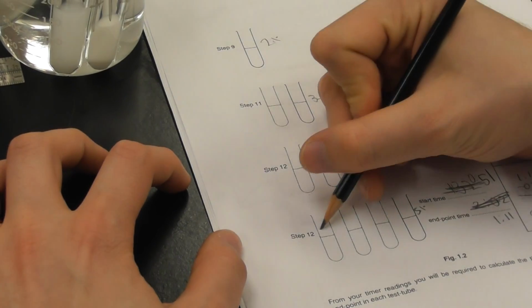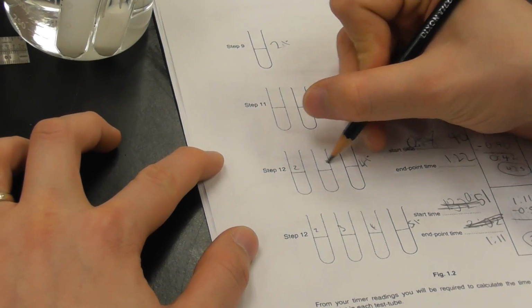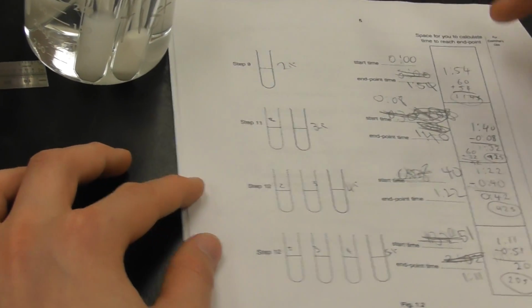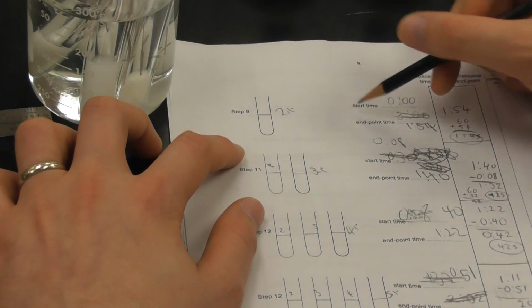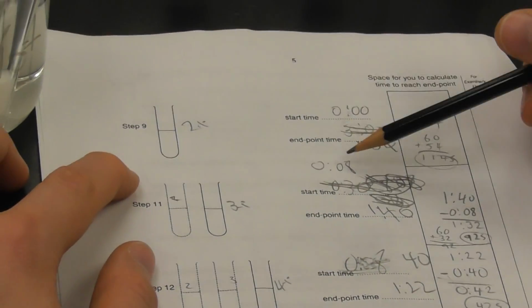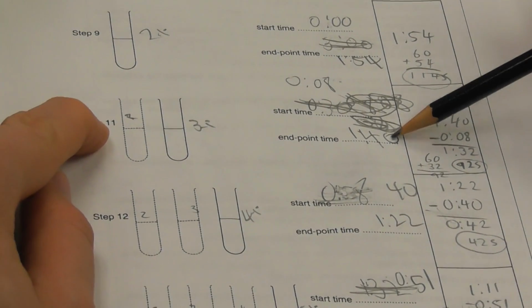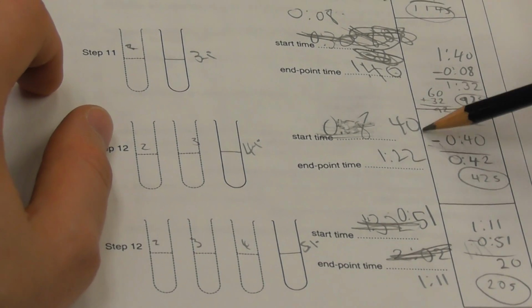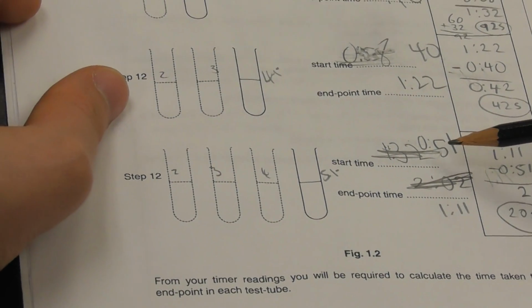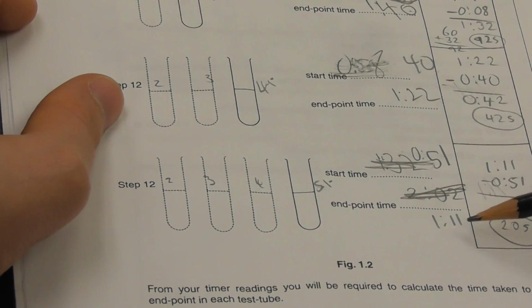All right, so my 2% started at 0, and its end point was 1 minute and 54. My 3%, I started at 8 seconds, and it ended at 1 minute 40. My 4%, I started at 40 seconds, and it ended at 1 minute 22. And my 5%, I started at 51 seconds, and it ended at 1 minute and 11.